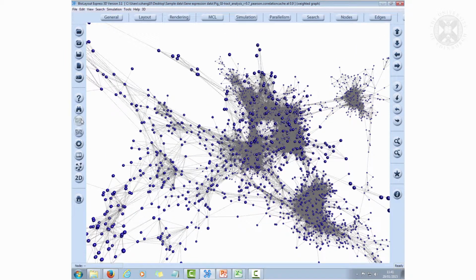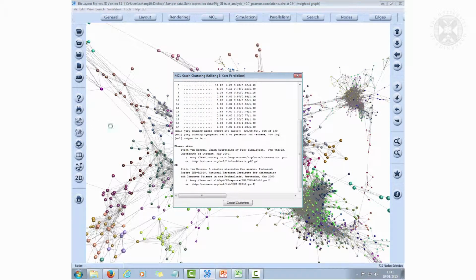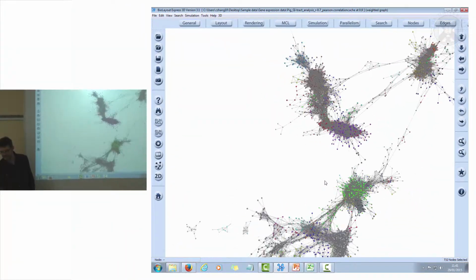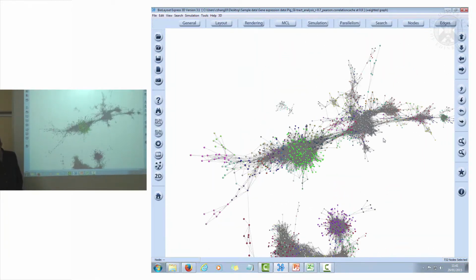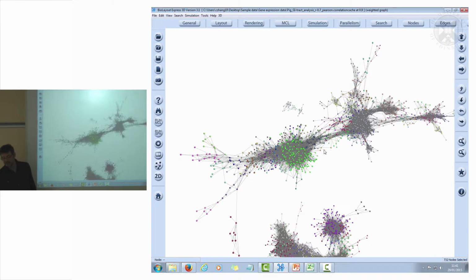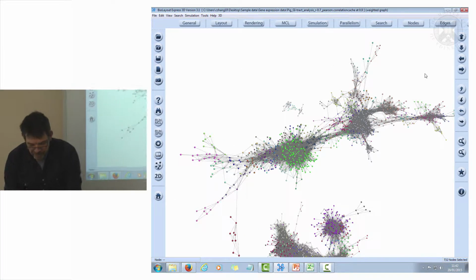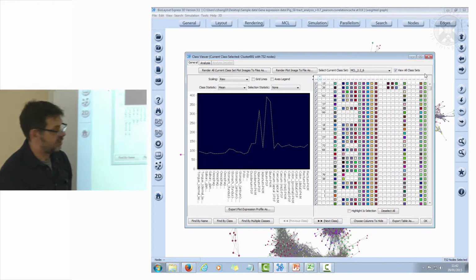So again, running the MCL, now routine to you all. We can run this on. Okay, so a lot more structure, a lot more things going on with this data set, a lot more biological variation associated with this. And I'm conscious of time. I'm just going to quickly go through this and then go through some of the things you can do.